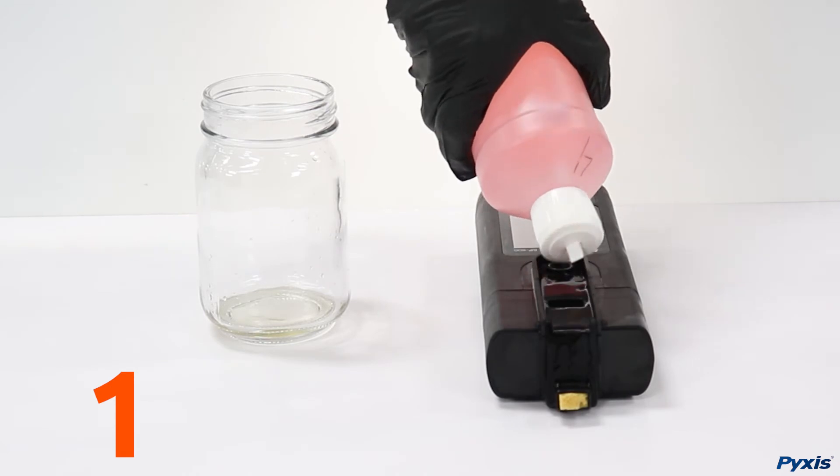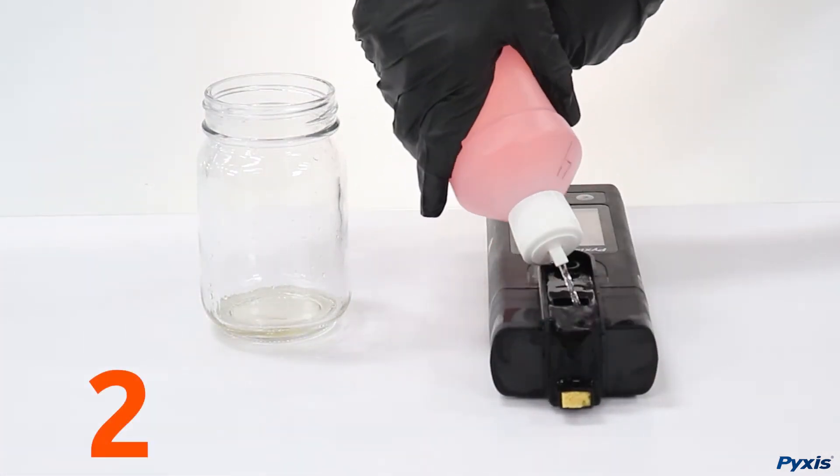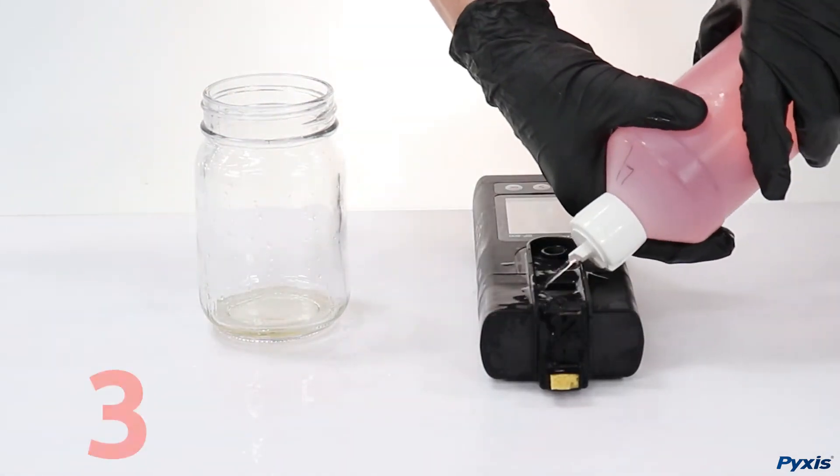Make sure to rinse the pH ORP module with the pH 4.0 calibration solution or sample water. Do not use DI water as this may damage the electrodes.